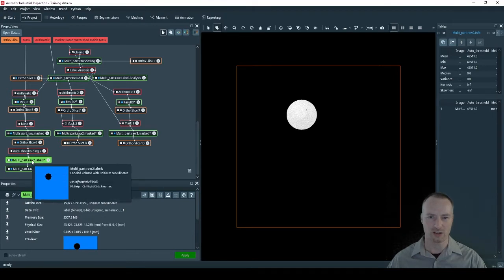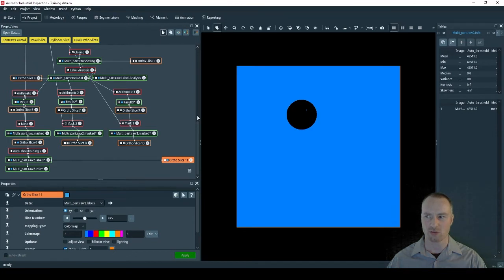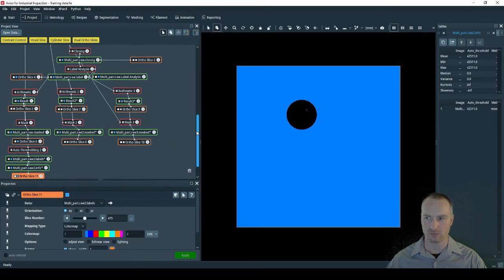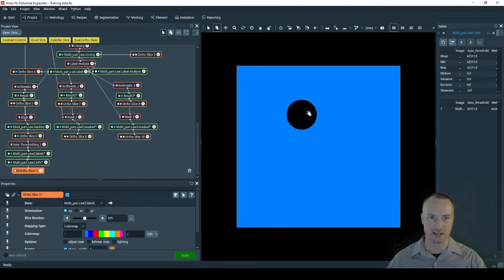If we click on the labels we can now use an ortho slice to ensure that the porosity has been adequately picked out. In this case we can see the pores have been isolated, however so is all the air outside of the component.